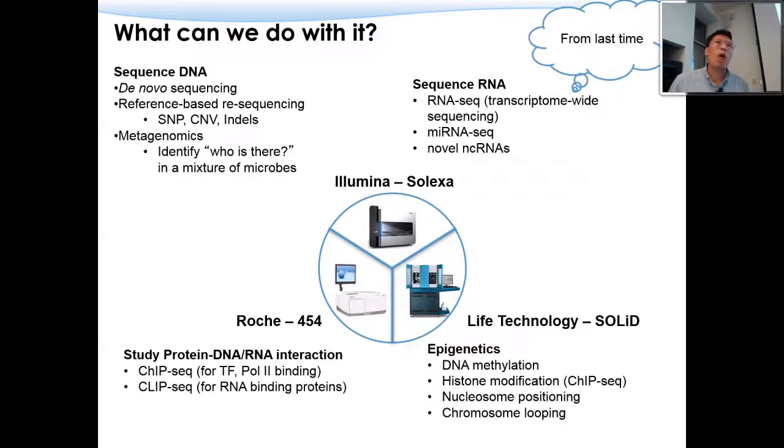So when we do it, our goal is not to see what the genome of this species is, rather how different my DNA is compared to the reference genome. So now we are coming into the game of how to identify the SNPs, how to identify the copy number variations, insertions, deletions, and so on.